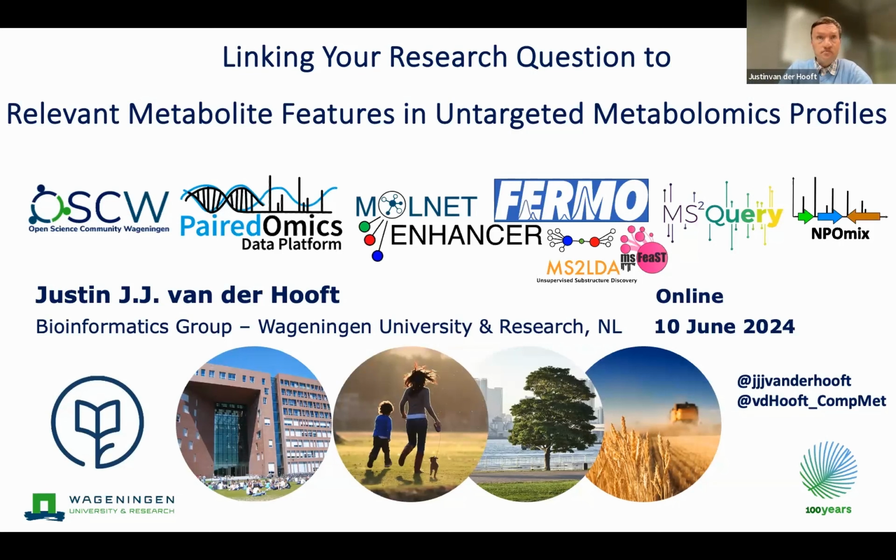And as you can see on the slide, there's a bunch of tools that we have worked on over the past 6 years. And today, I will highlight two more recent ones, Fermo and msFeaST. So the title of the talk is linking your research question to relevant metabolite features in untargeted metabolomics, or non-targeted, or wide screening, whatever you prefer to say.